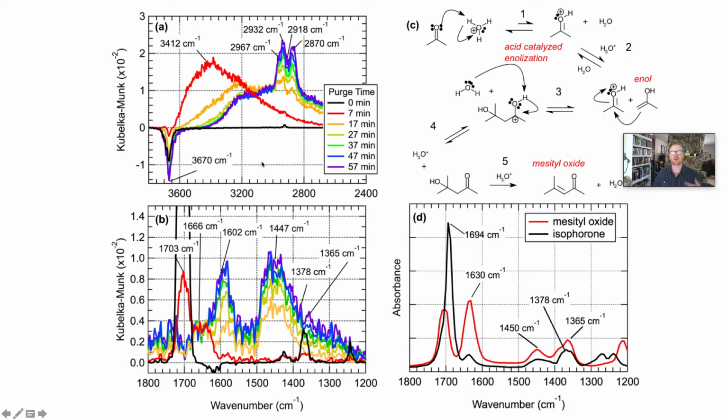And so then as we started recording spectra in time, you can see we had a really dynamic looking set of DRIFTS spectra. So you can see these hydroxide peaks grow in more negative. So I'm not going to summarize this mechanism. I did this in a previous talk. But basically, if we look through the spectra in time, it more or less confirms this mechanism.